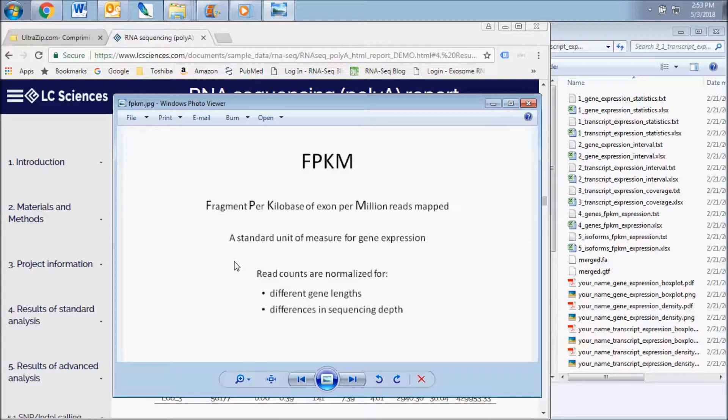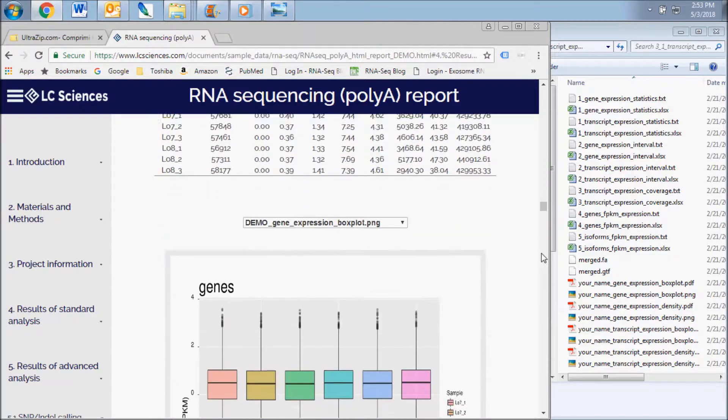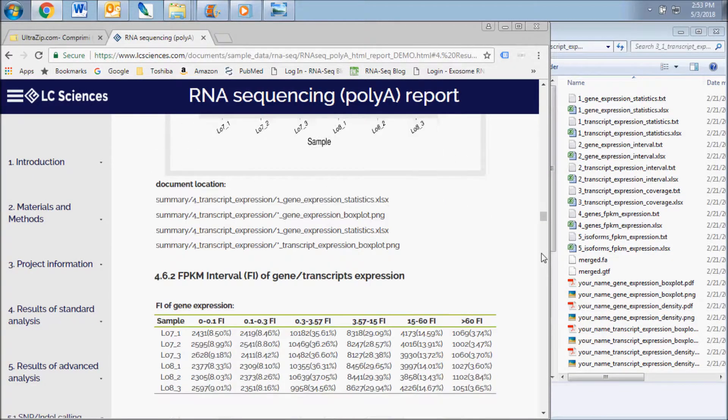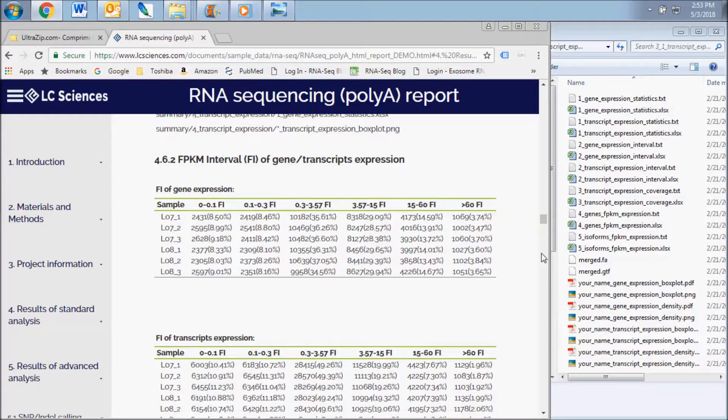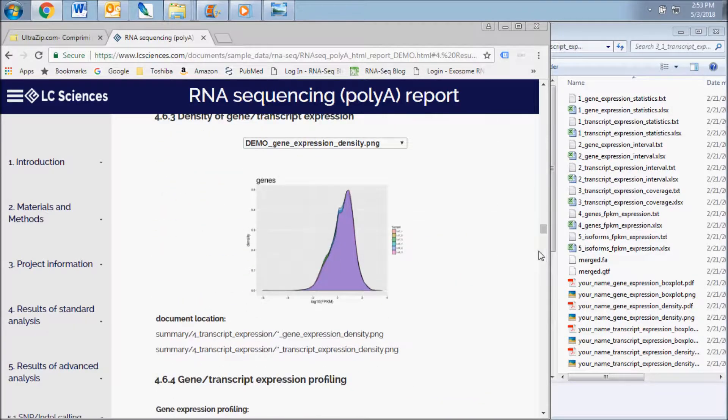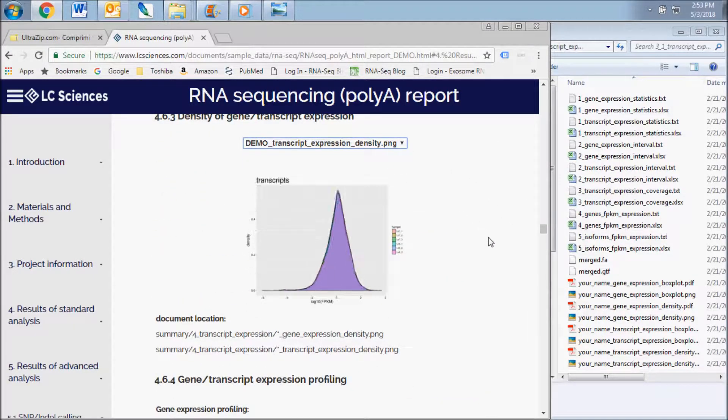The data in the box plot, the FPKM interval chart, and the density graph give a comparison of the overall gene expression between samples. Significant variations in overall expression between samples would be apparent here.